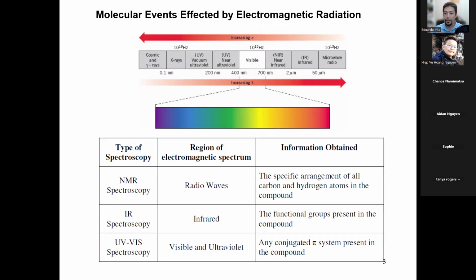Like I mentioned, for radio waves, you're going to use that next semester for NMR to find out how many hydrogens are attached to a carbon. But I won't spoil the surprise. You can figure that out next semester. This semester, we're using IR, infrared, to look at the functional groups vibrating in a molecule, right?